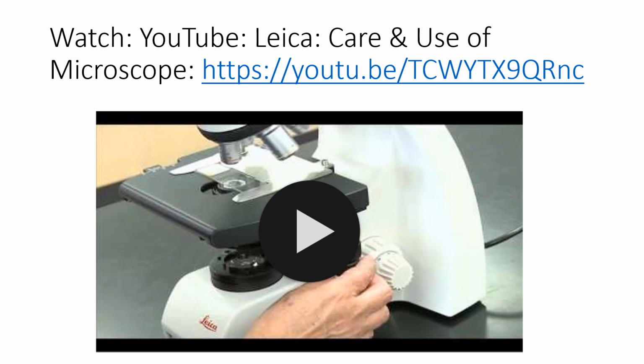This video is a great demonstration of the proper use and care of a microscope. Watch the video at the link provided. This link is also available in the protocol for Lab 3B.